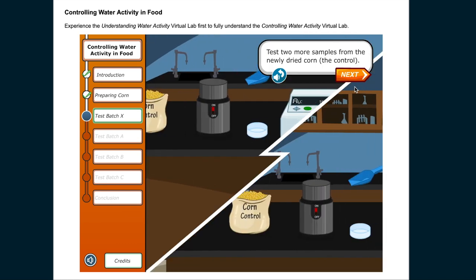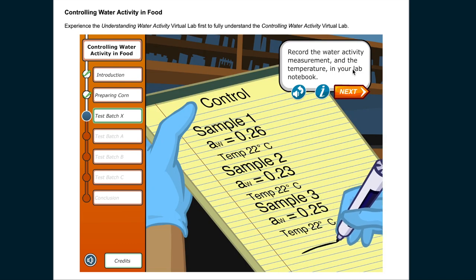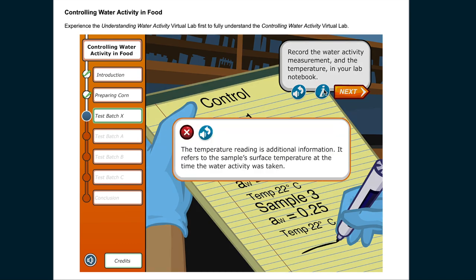Test two more samples from the newly dried corn, the control. Record the water activity measurement and the temperature in your lab notebook. The temperature reading is additional information. It refers to the sample's surface temperature at the time the water activity was taken.